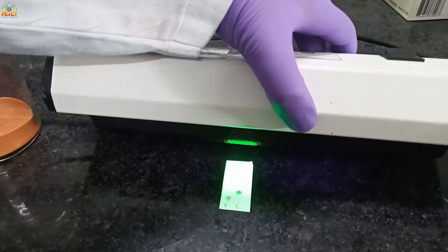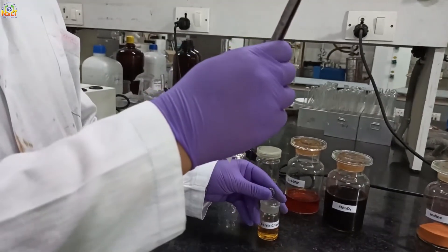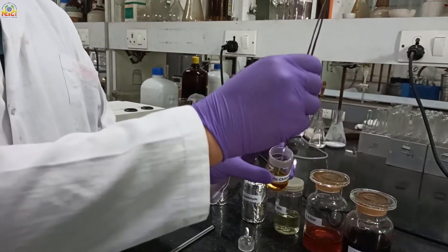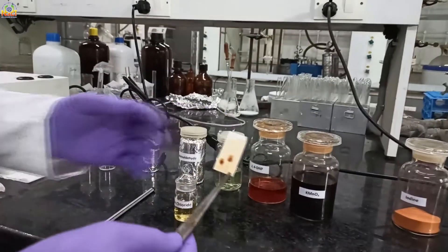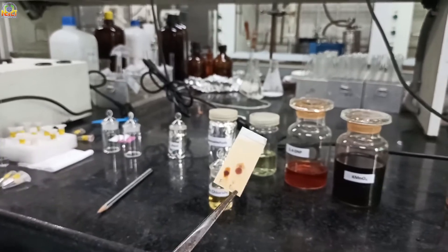First we see this TLC under UV light — two spots are visible. As these two spots are phenol, I am dipping this TLC in ferric chloride stain. Spontaneously it stains the organic compound with no heating required. If your compound is phenol, it is quickly visible with ferric chloride.